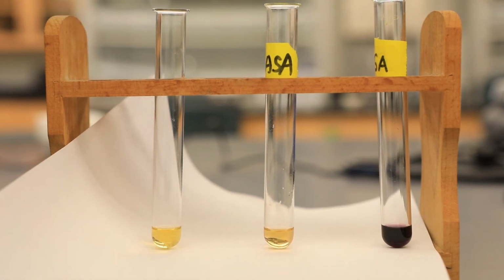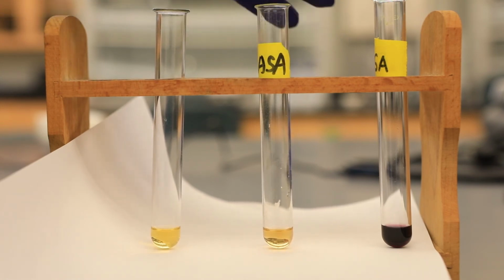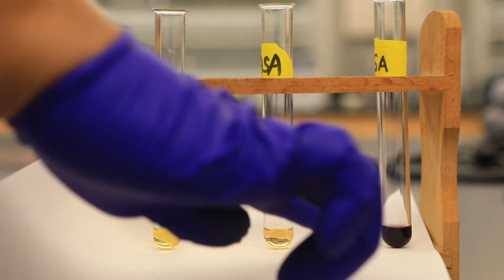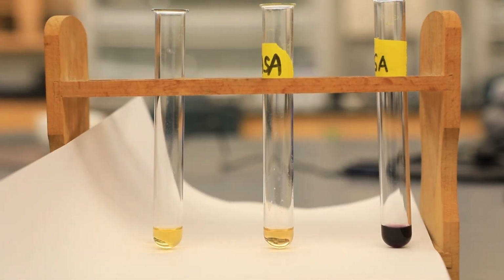Should we go ahead and consume this aspirin? Absolutely not. Because in the laboratory, I can assure you that there are lots of impurities still in our final product. But it's more or less fairly pure. Only a small amount of salicylic acid is possibly present, compared to pure salicylic acid.